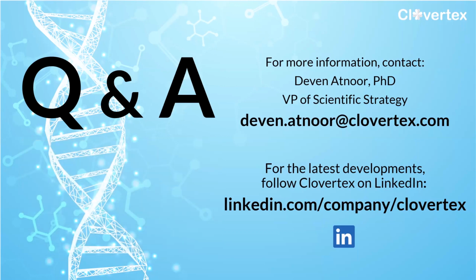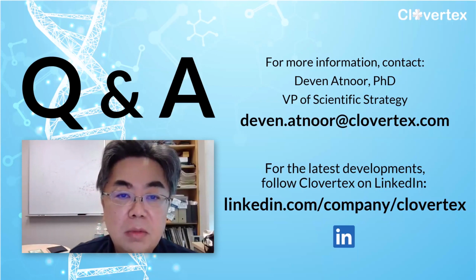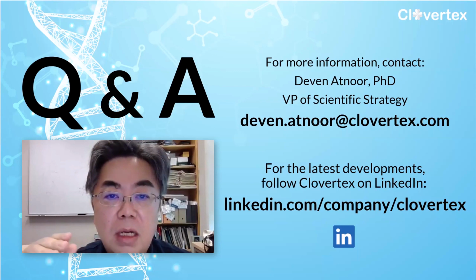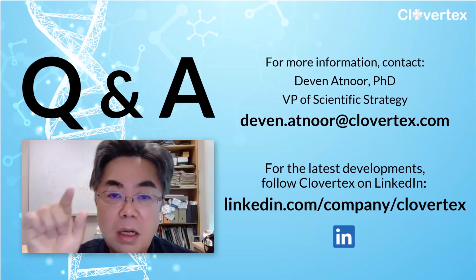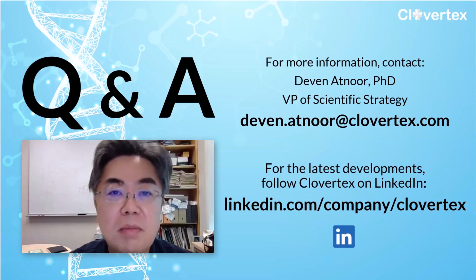Great, thank you. A question from Nemul, hopefully I'm pronouncing that correctly. For cryo-read, what resolution is required to build the nucleic acid? Does it require DNA or RNA sequences as input? Yeah, good question. For the same reason, cryo-read needs resolution up to 5 angstrom currently. But if you have a sequence, we can map the sequence. If you don't have the sequence, we just make the main chain structure of DNA RNA. So sequence is not necessary, but if you have it, we can map it.